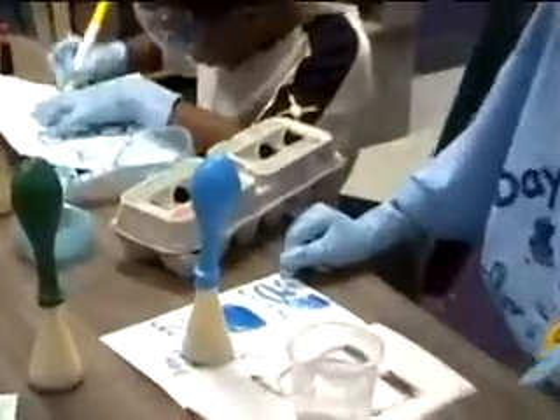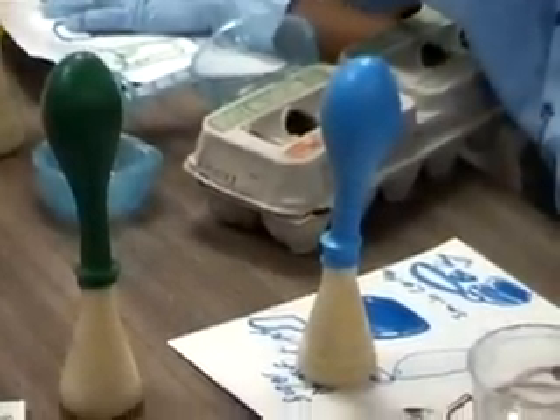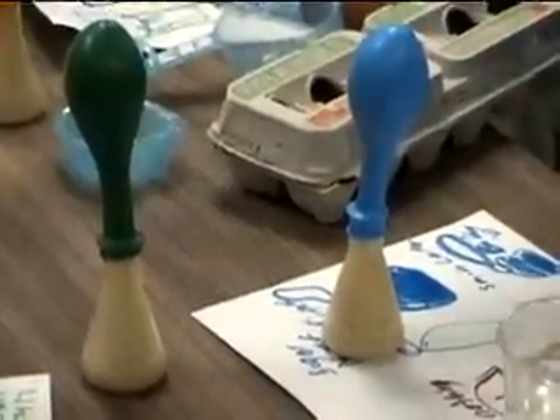You might think that doing experiments like this one is too time-consuming. However, this experiment, including the student's journal entry, took a total of 28 minutes.